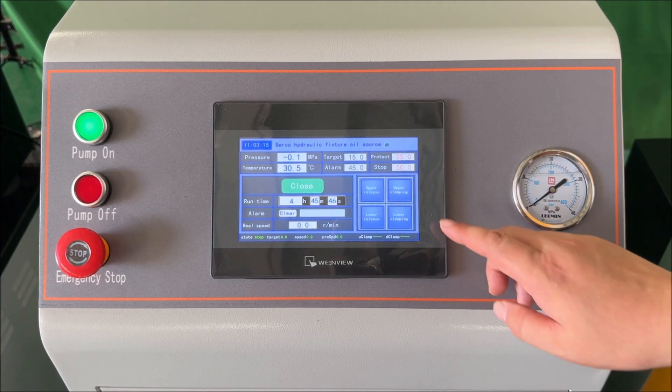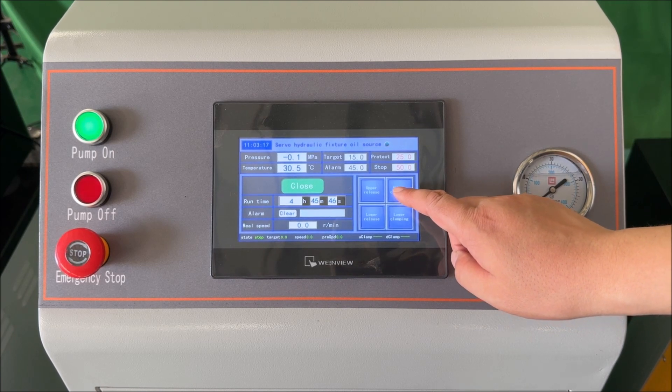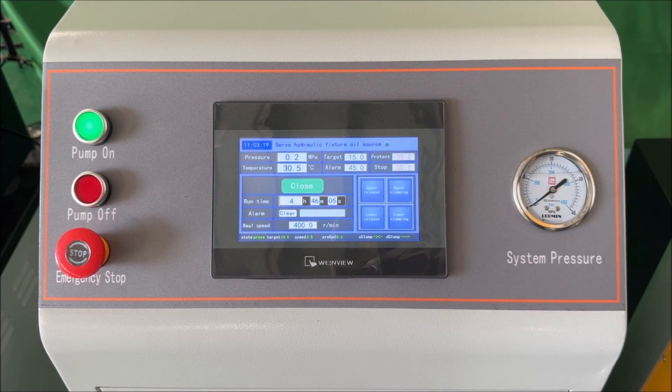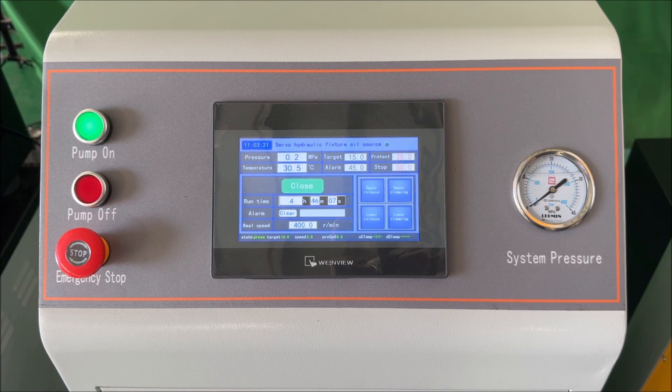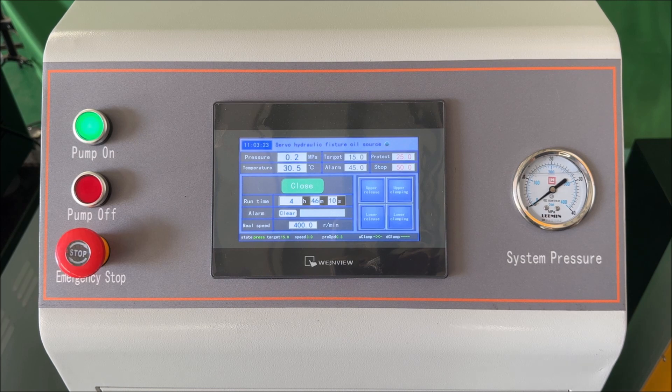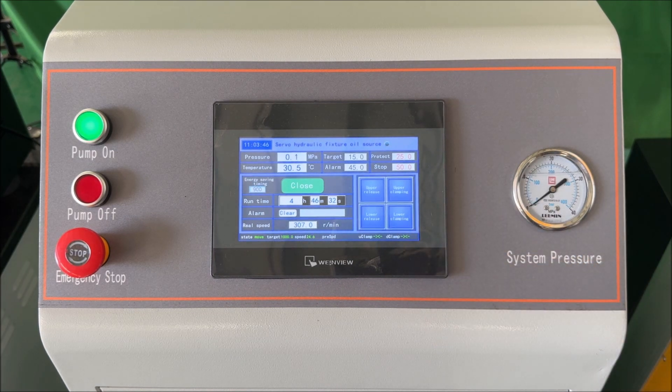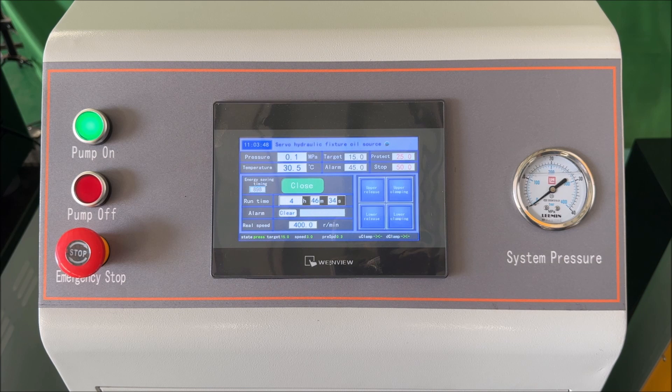First, press upper clamping. For clamping, the pressure will reach 15 megapascals as indicated by your target. Then press lower clamping. The system will reach its set target pressure.